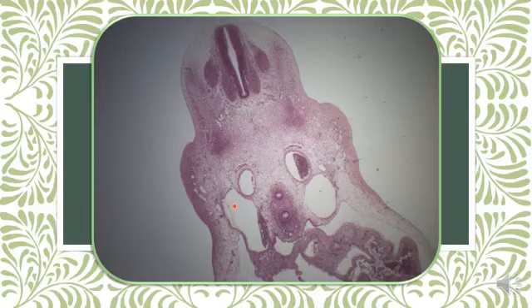Lateral to the dorsal aorta, a cardinal vein. Ventral to the dorsal aorta, a foregut. Here you can see two tubes in the foregut. Dorsally, esophagus, and ventrally, trachea, and the septum divided the foregut.